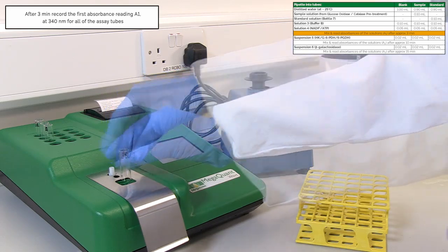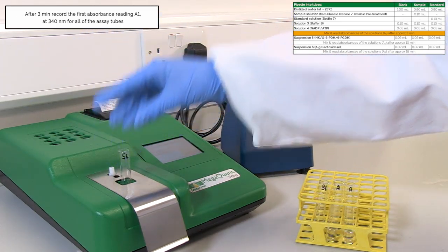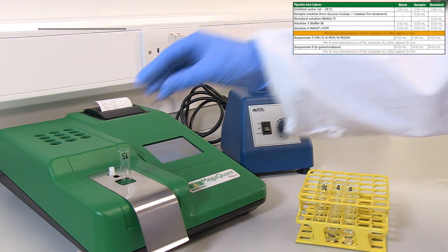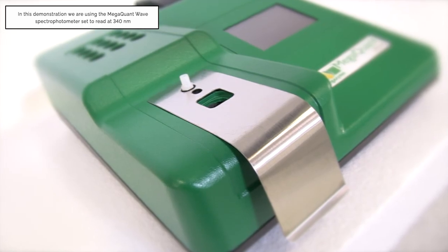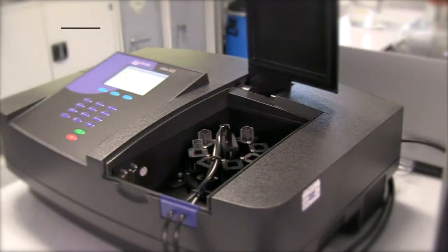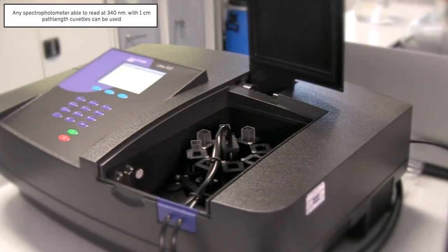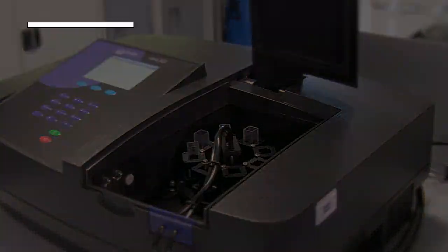After 3 minutes, record the first absorbance reading A1 at 340 nanometers for all of the assay tubes. In this demonstration, we are using the Megazyme Wave spectrophotometer, set to read at 340 nanometers. Alternatively, a recording spectrophotometer with 1 cm path length cuvettes can be used.